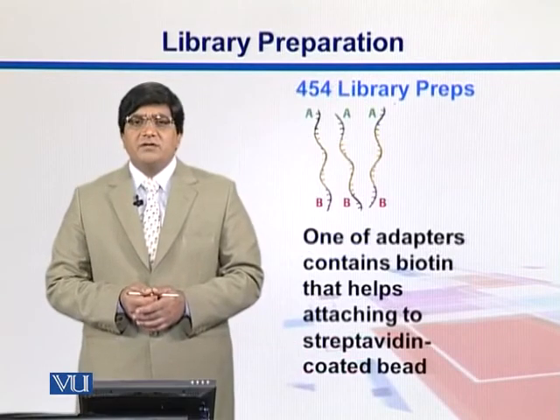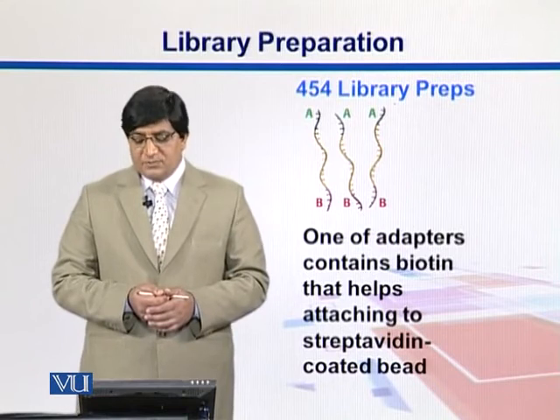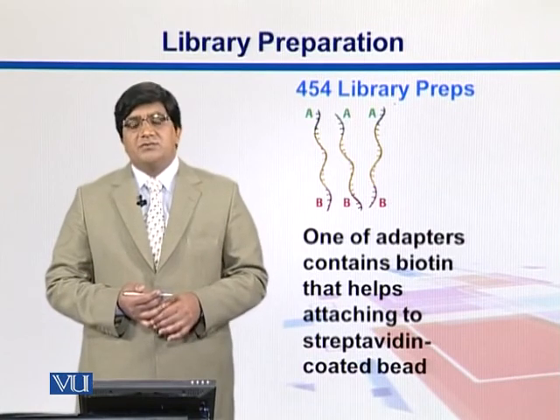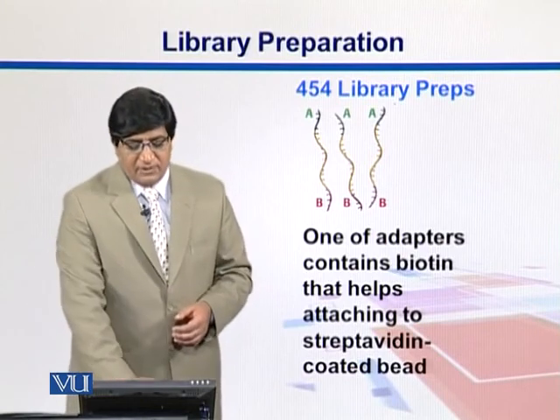In 454 sequencing, there is a small difference in the adapters: one of the adapters contains biotin that helps attach those fragments to streptavidin-coated beads. Those beads are used as amplification and sequencing stations. We will look into them later on.